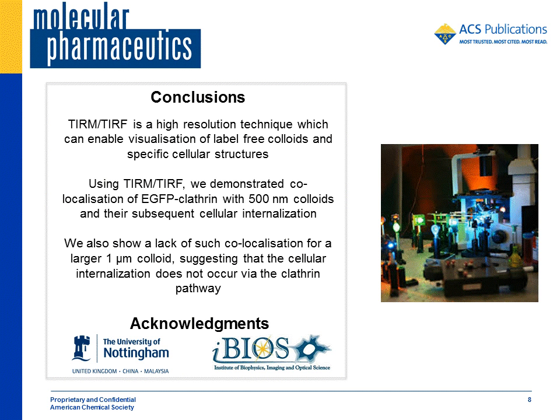So in summary, we believe the TIRF microscope is a powerful technique to visualize label-free colloids and specific cellular structures at high spatial and temporal resolution. The TIRF technology has also enabled demonstration of the co-localization of EGFP-Clathrin with unlabeled 500 nanometer colloids and their cellular internalization, and this study indicated a clathrin-mediated route of endocytosis for these colloids. We've also shown a lack of such co-localization for a larger 1 micron colloid, suggesting that the cellular internalization in this case does not occur via a clathrin-mediated pathway.